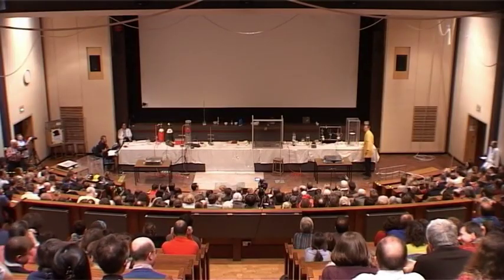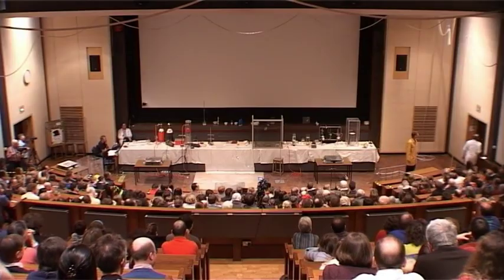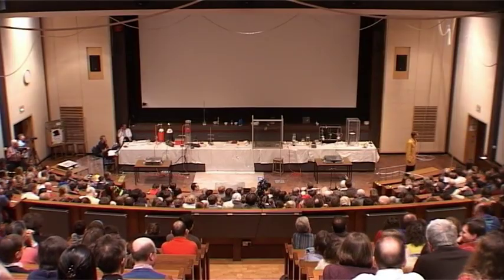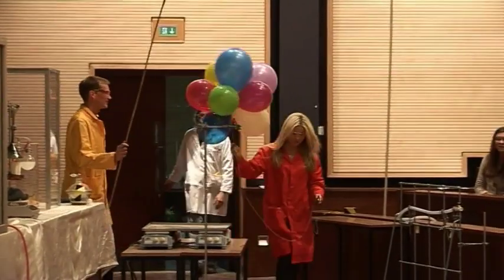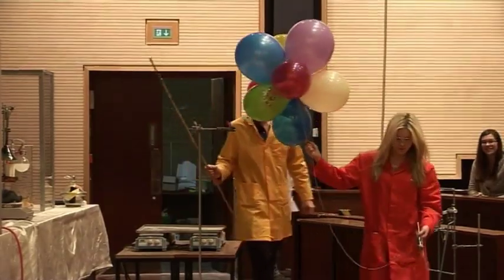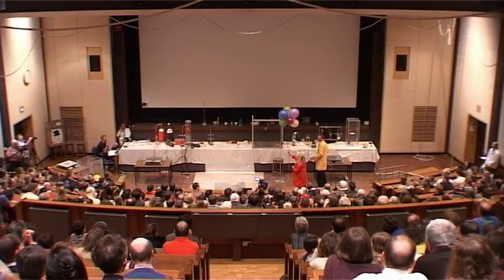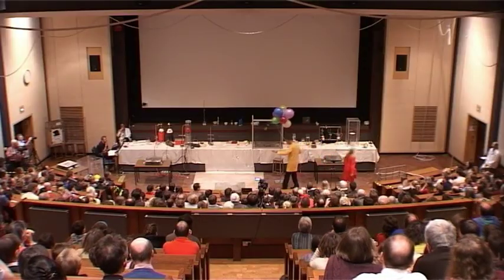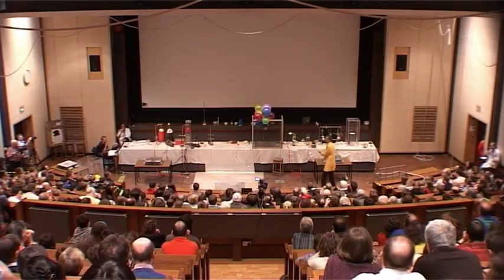Well, in case you missed that one, we've got a few more for you. Okay, thank you. All right, okay, so let's see what happens with this lot.